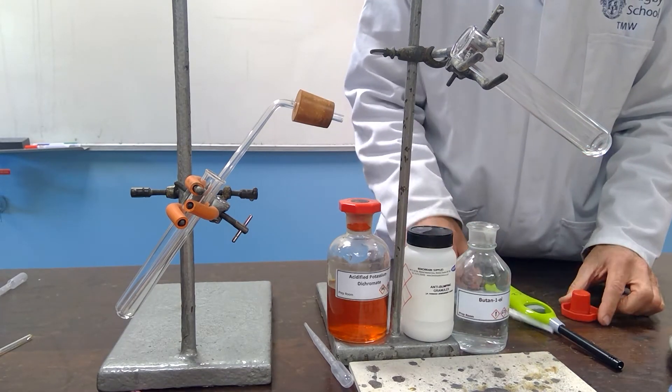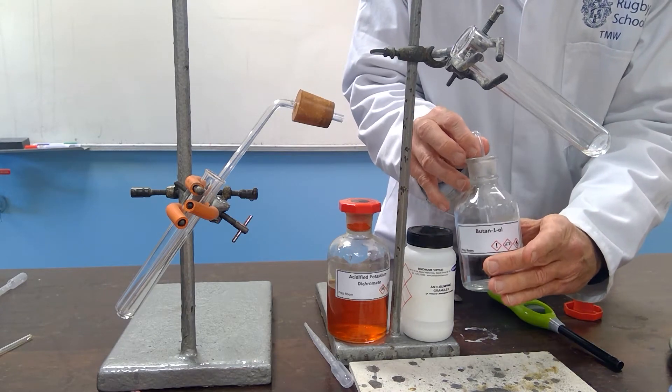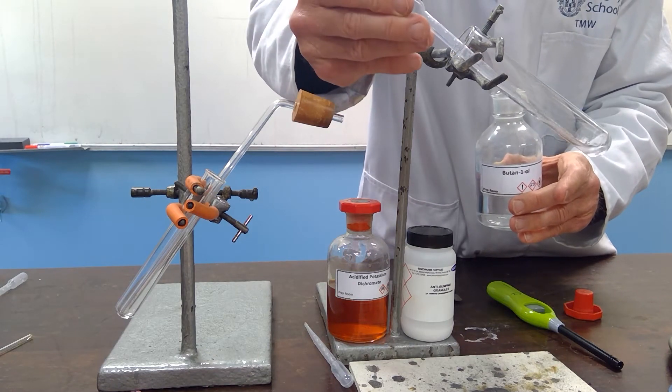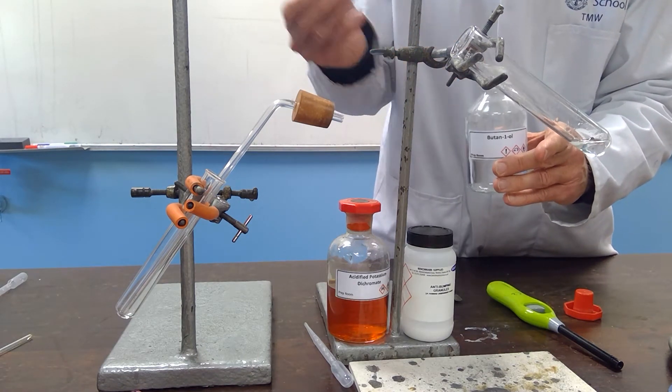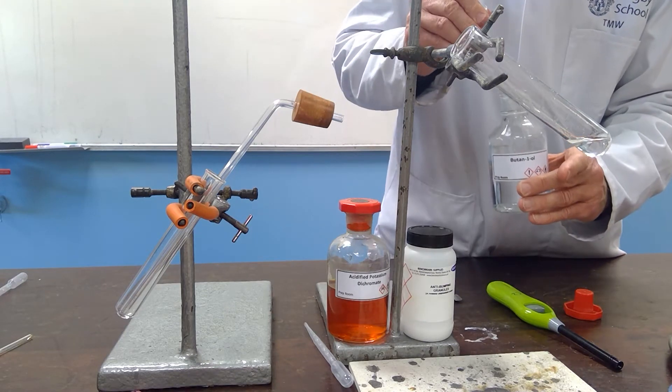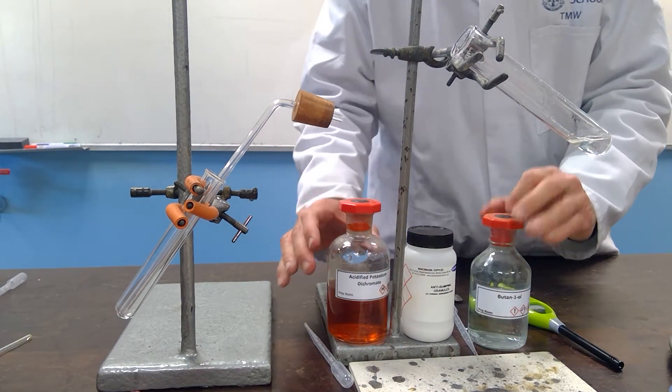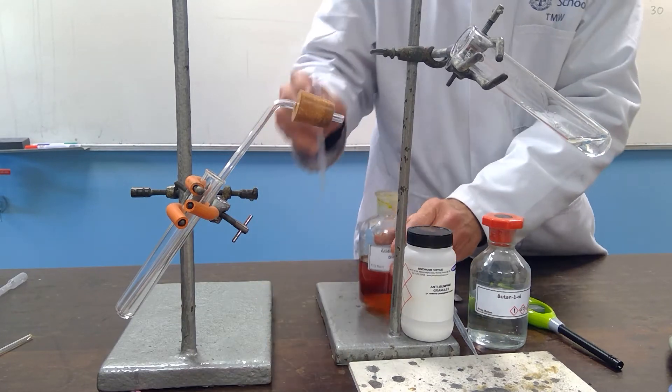So, in order to distill over the products as they are formed, we will take some of the butan-1-ol, as we did before, and react that with the acidified potassium dichromate once again.